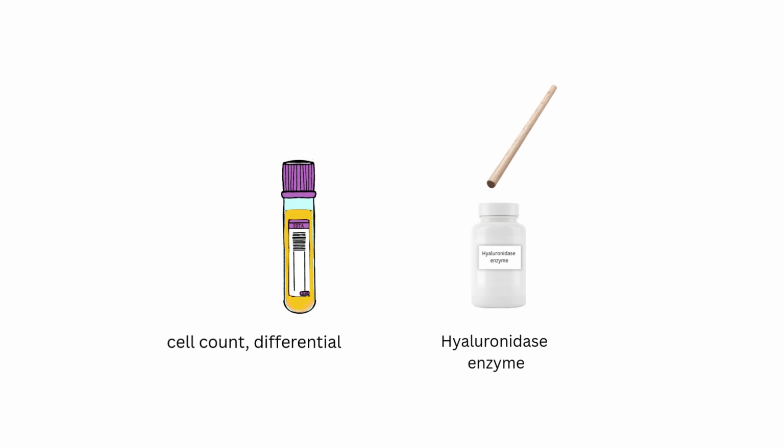Healthy synovial fluid is normally highly viscous due to the hyaluronic acid. Reagent hyaluronidase enzyme may be added to digest hyaluronic acid to reduce the high viscosity, making it easier to examine by automated instrumentation and microscopy.